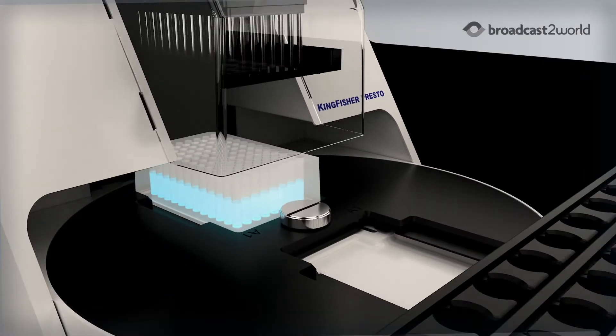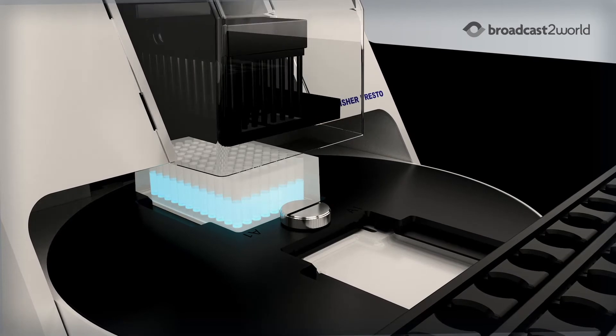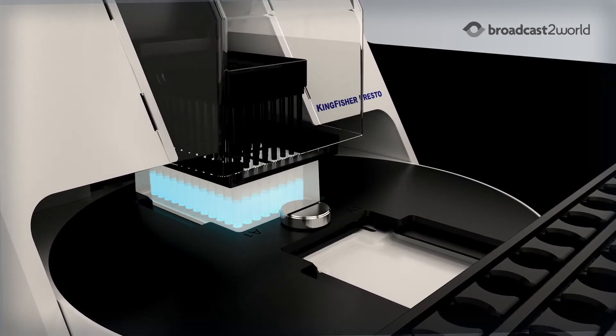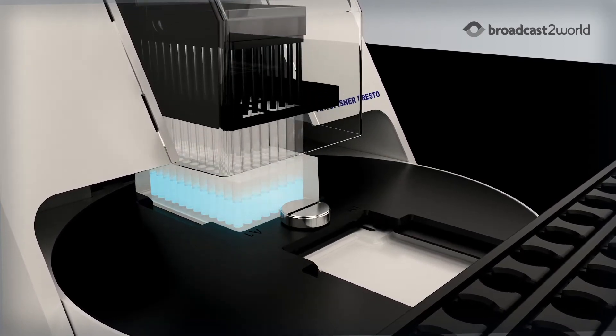In this process, the magnetic rods of the Thermo Scientific Kingfisher Presto System are lowered into the plate and attract the magnetic beads.